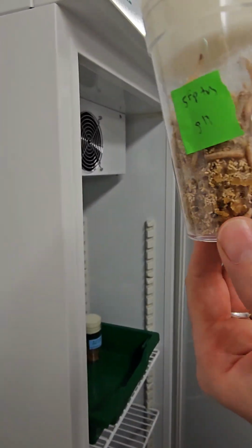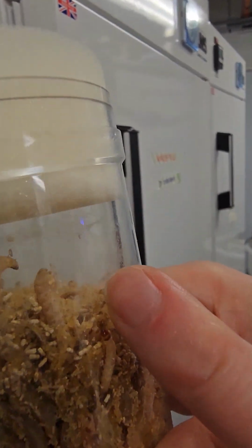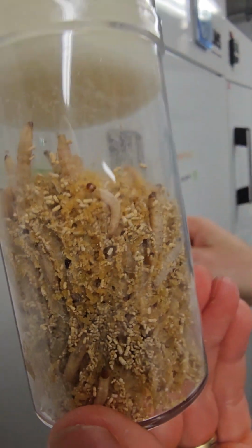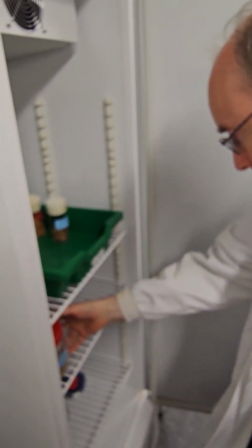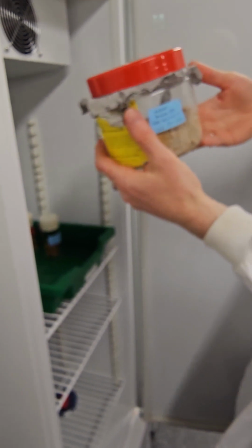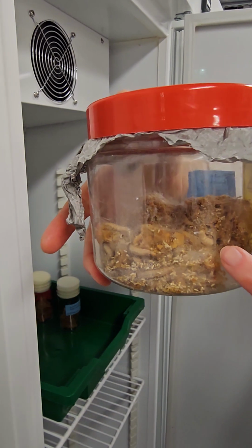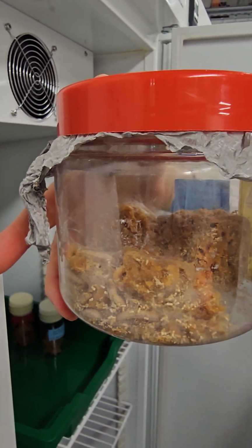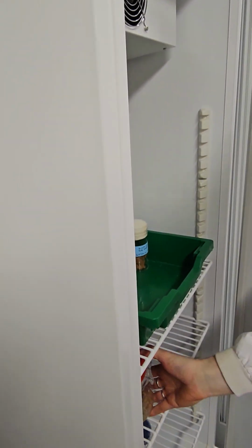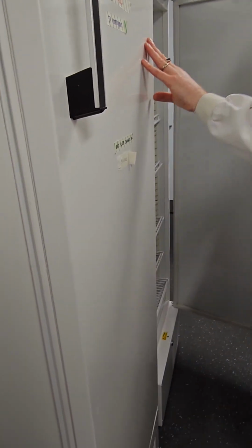Yep, they're busy on that, and they're even spinning silk. Can you see at the top there? Oh yes, I can. Their little silky webs. So some of those will be getting ready to pupate. So then they go from there. Have they got any pupae in there? So you can see they get a little bit bigger. These ones do have little prolegs. So they move quite quick as well. These little ones. I will keep that in there.